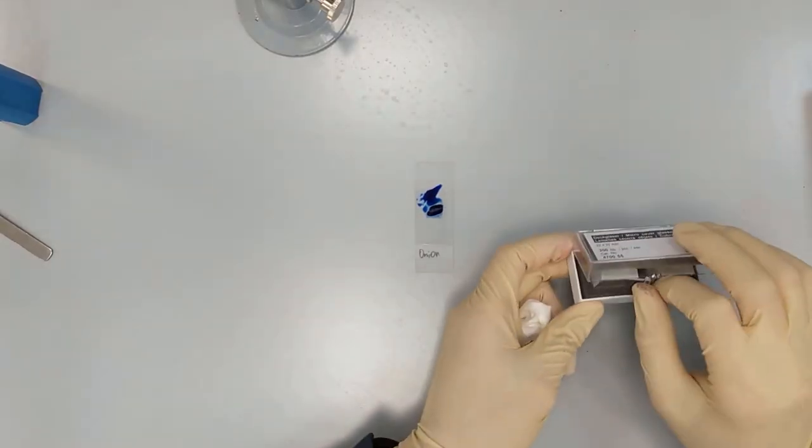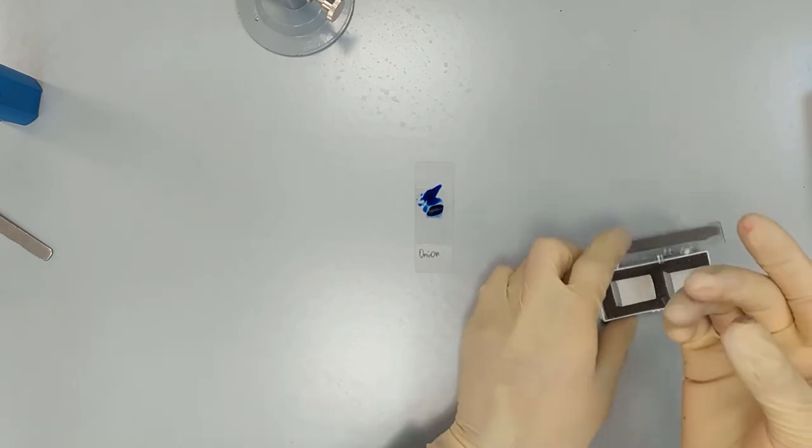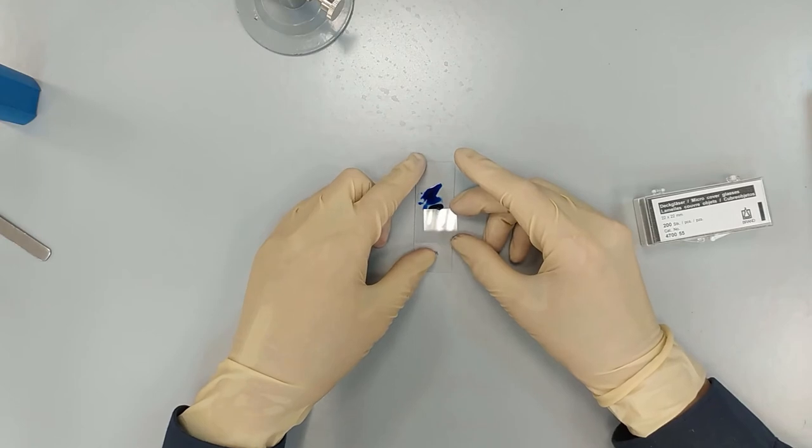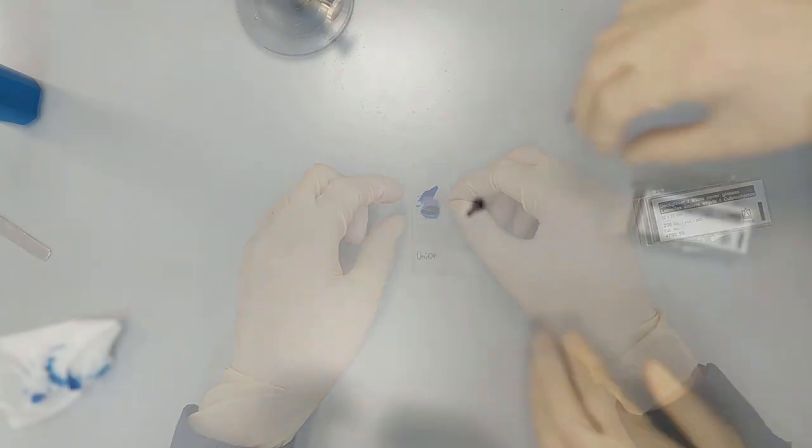Now we take the cover slip. One cover slip is enough, and we are going to place it on top of our cells.